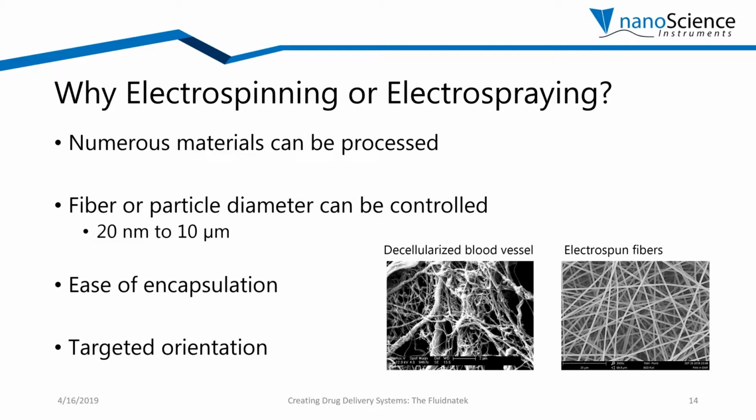Both of these techniques are able to process fibers and particles at room temperature, and this is really suitable for the use of thermolabile materials. When I say thermolabile, it's materials that are sensitive to temperature. So this is really important, especially when polymer blended solutions are needed.